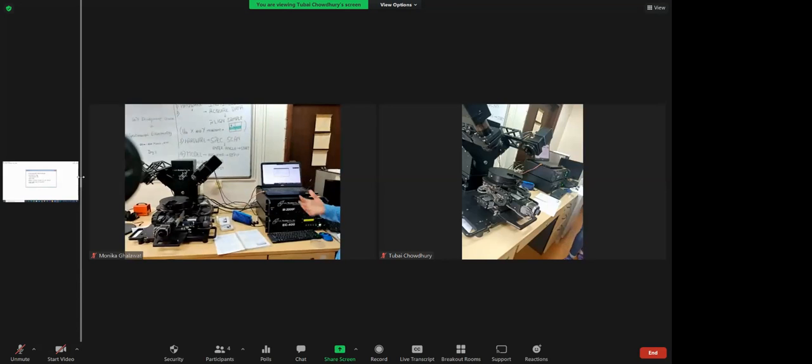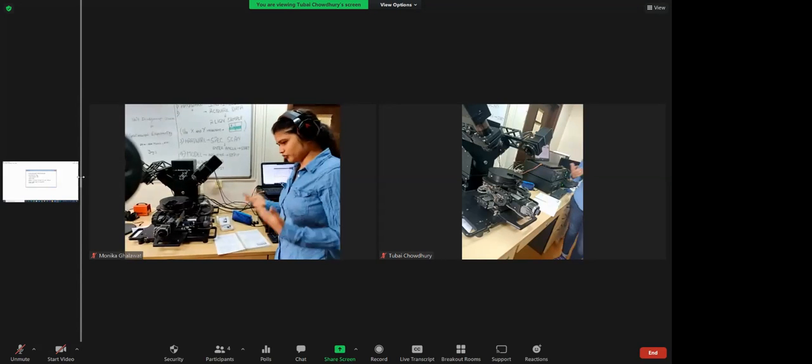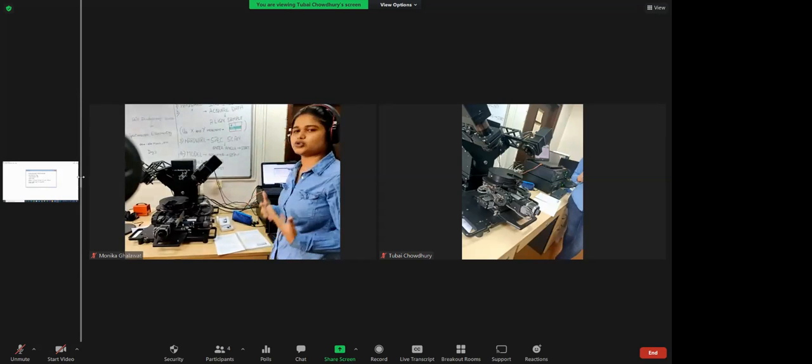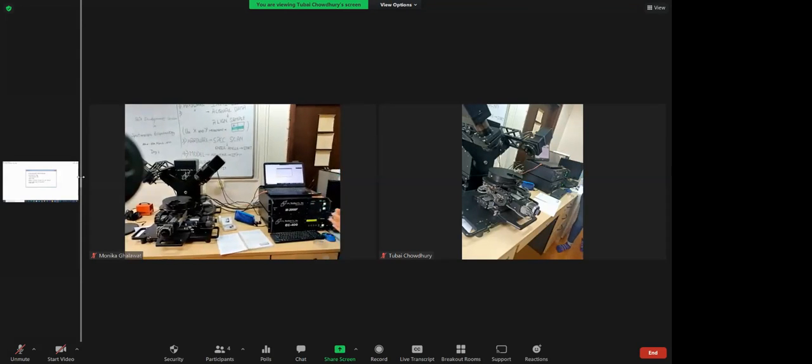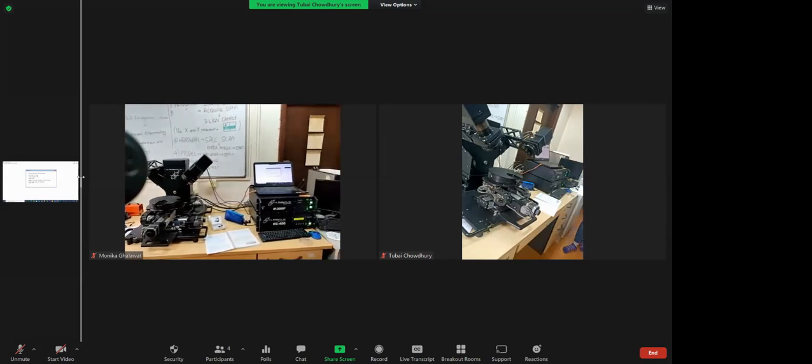After completion of scanning, it will ask you to save the data. Once you save your data, you can enter your model, depending on what knowledge you have of what kind of substrate you have taken and what kind of material you have coated over it. So you can choose the model according to that. After you add the layer of substrate, there will be no option of fitting, and in the upper thin film, there will be an option of fitting, like thickness, n, k, whatever you want to know, you can go for it.